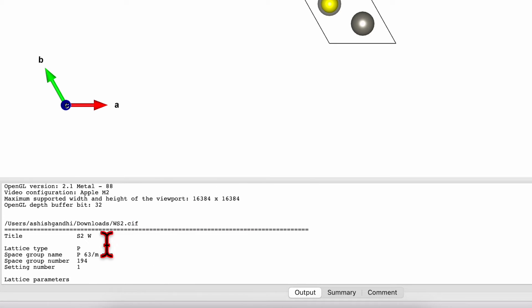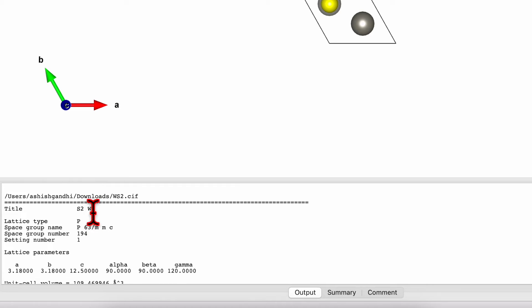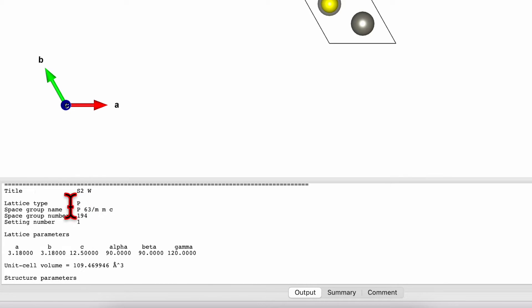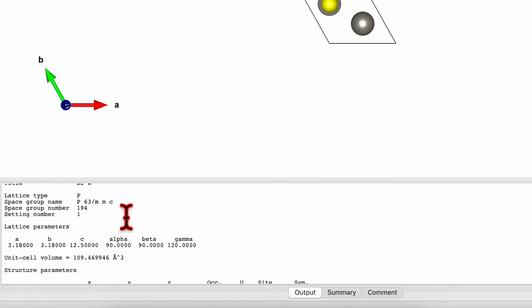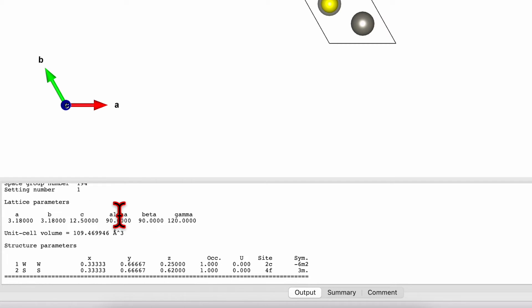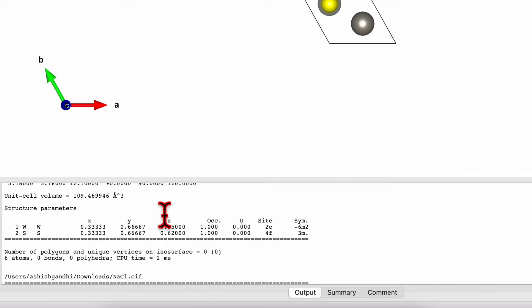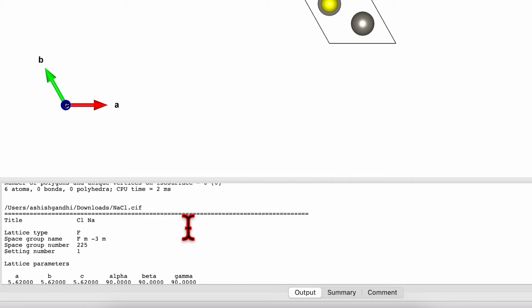So this one is WS2. Lattice type is P and the space group is P63MMC, space group 194. Then we got the ABC value and alpha beta gamma value and the XYZ coordinate occupancy in all those details.